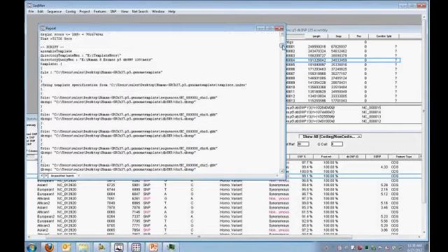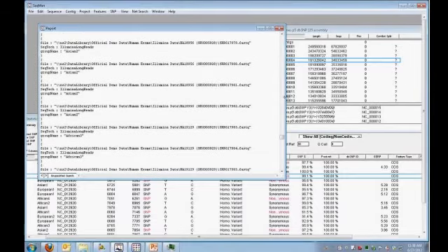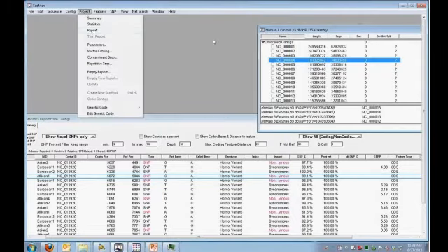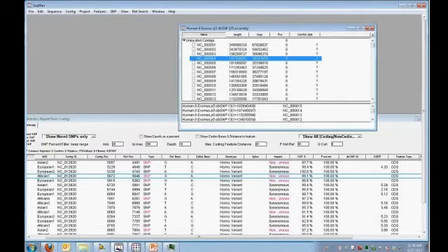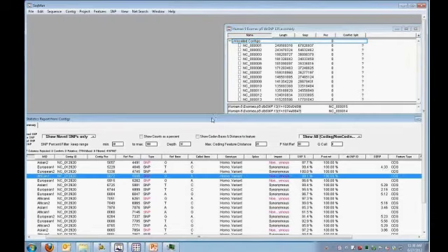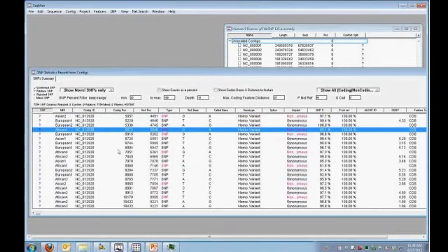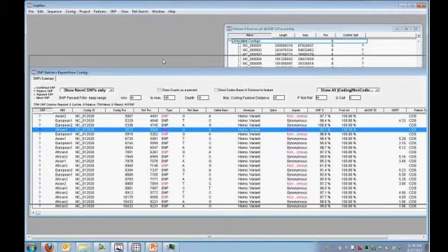I also get a script so I can see how the assembly was run. And so that's some of the information here. That's under Project Report. And then this is the window that shows the contigs. I can highlight this header and generate reports then for the entire assembly. So what I've done here is I've highlighted the header and gone and generated a SNP report. And so what we're viewing here is the SNP report then for all 8 of these exomes altogether.